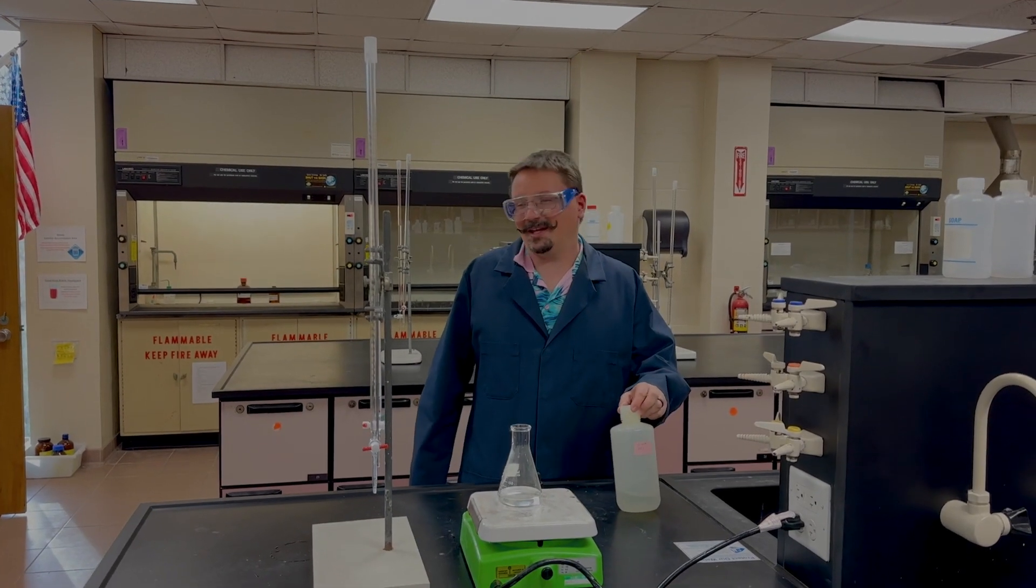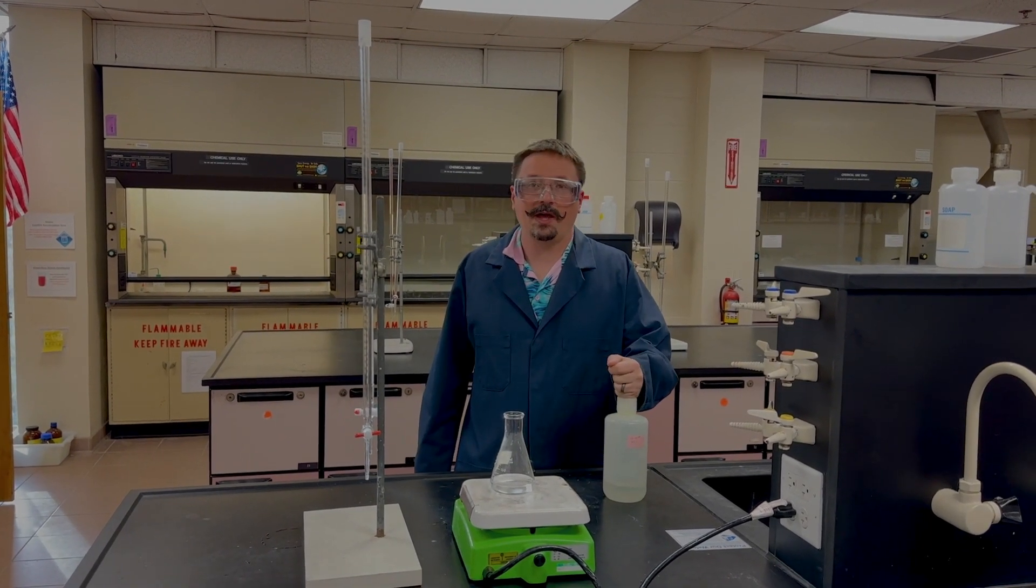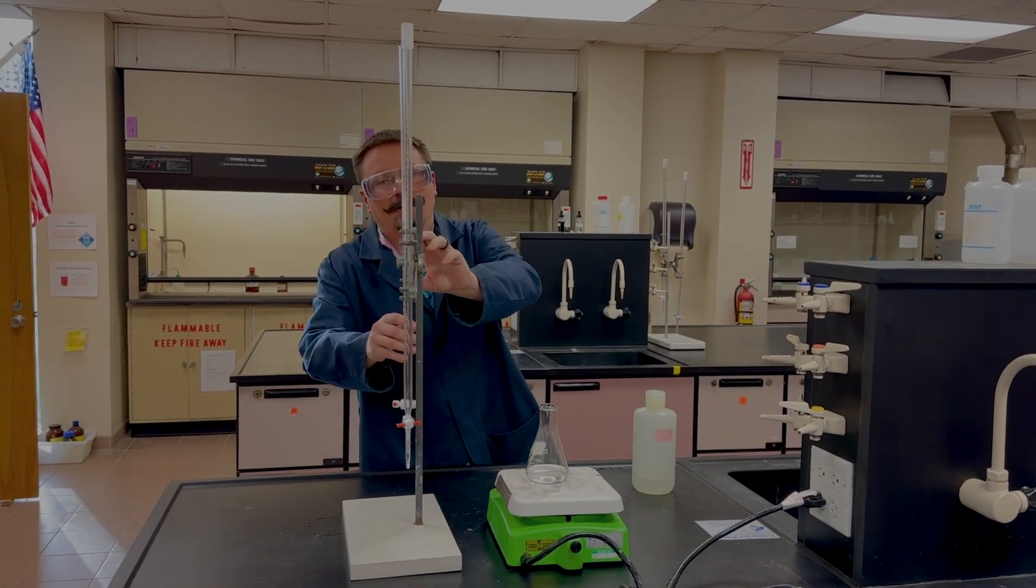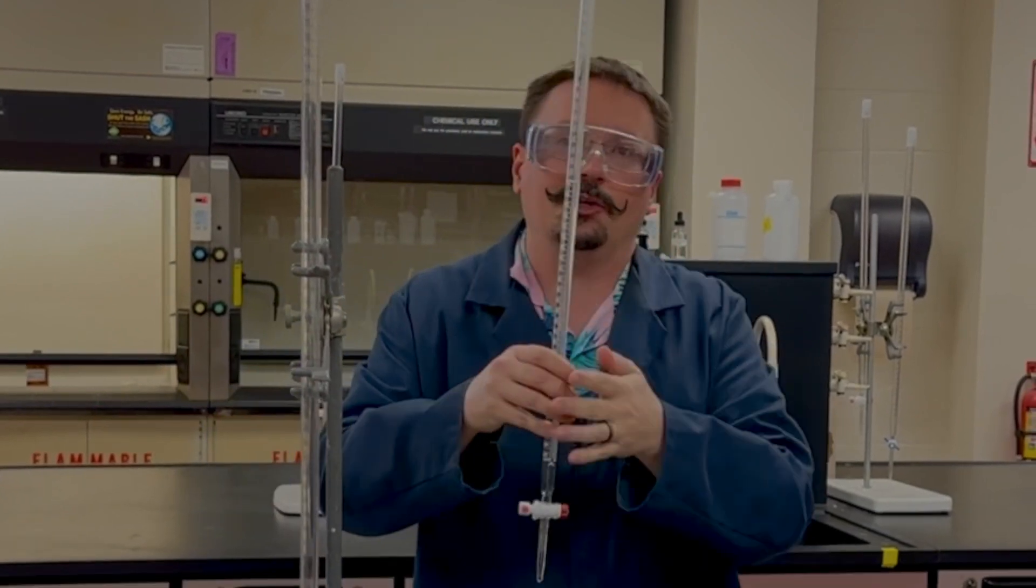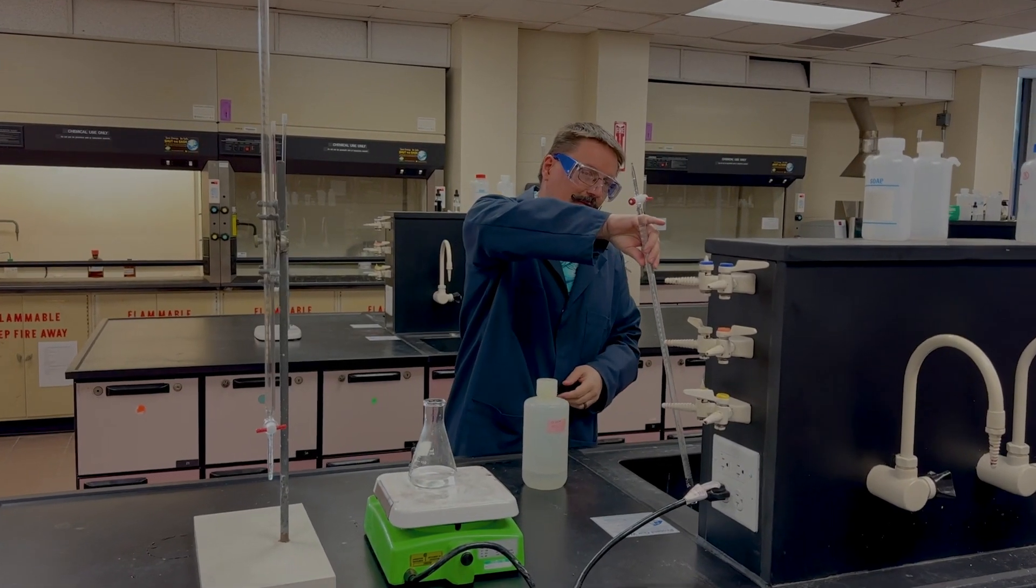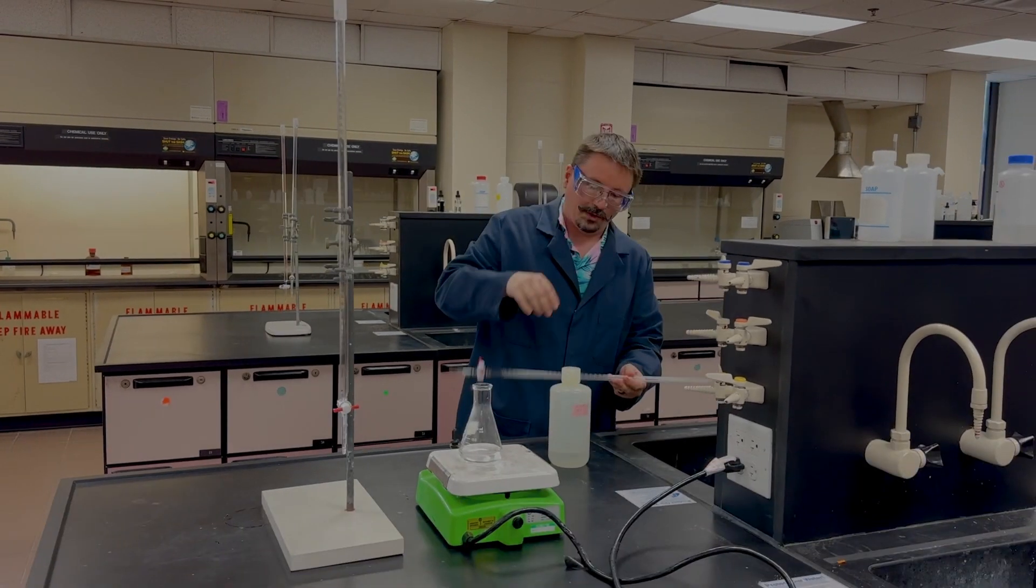All right, hello again. We're going to go over the soda ash determination experiment. This is primarily titration, so you can start with your burette again. Your burette should have DI water in it - that's what it should have been stored with - so you can just empty that out. We're going to titrate a base with an acid.